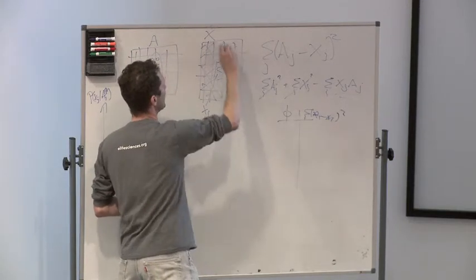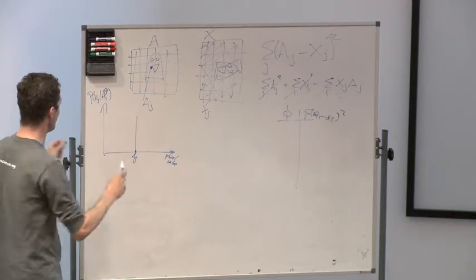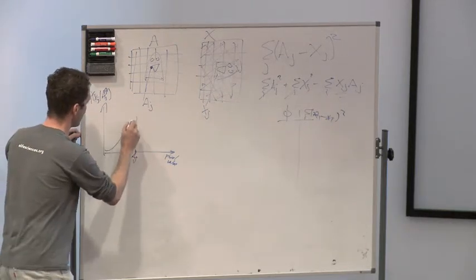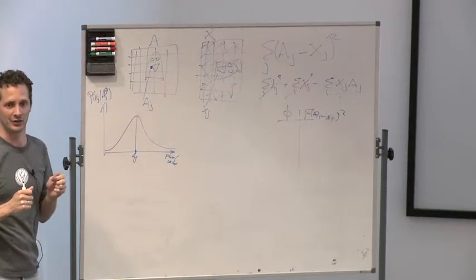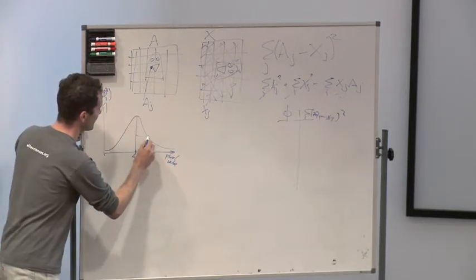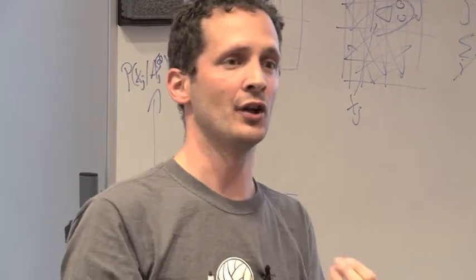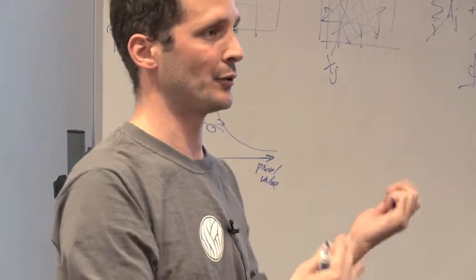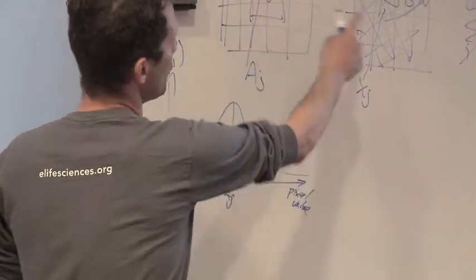It has a lot of experimental noise on it, which we can assume to be Gaussian. Then we can draw a probability distribution for observing the pixel value xj, okay? And the width of this Gaussian, I'll call sigma, is the standard deviation of how much noise is there in your experimental image, okay? Now, we can do that for one pixel.